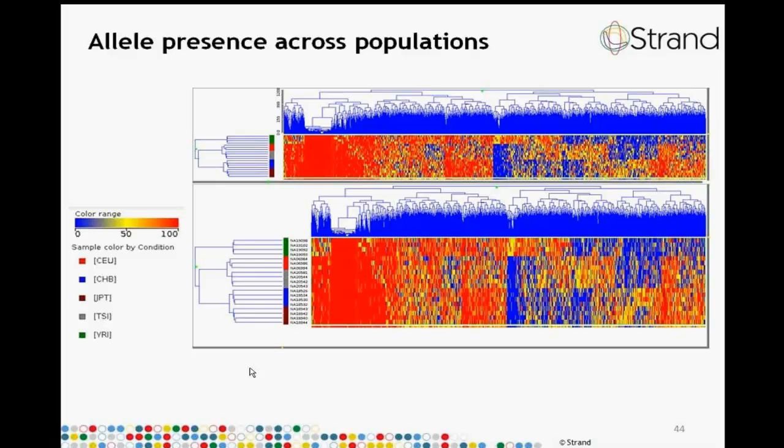So in other words, we can use the find significant SNPs to identify high quality SNPs which are consistent in populations, etc. But to view the relationships and the way they're distributed across the different groups, one can use the clustering tool. The clustering tool will also help you to choose any subtree out here and save that list of variant alleles. For instance, if you wanted to look at the variant alleles which are present in a homozygous nature in all of the samples, that would be the subtree out here. One would simply have to click on the subtree and save those variant alleles which are present in a homozygous manner in all of the samples.